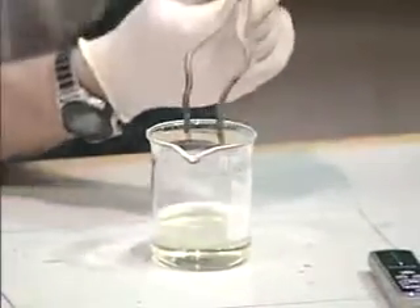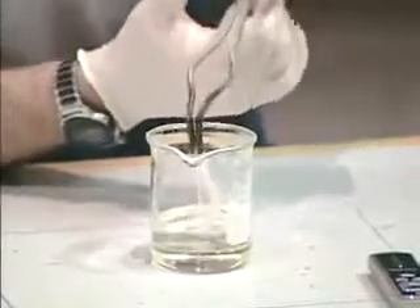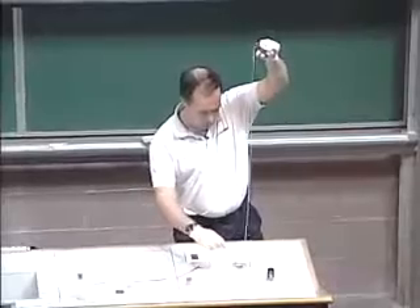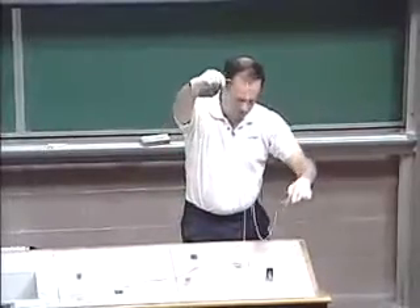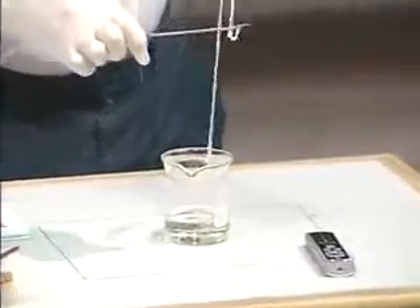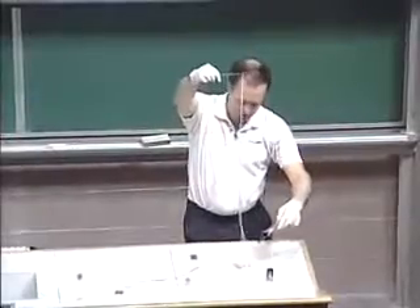So then I'm going to reach in here, and where the interface is, I'm going to pull out some nylon. Here we go — we'll see how much nylon we can pull out of this thing. There's a meter or so... two. There are records set for this, and I think it's actually in the Guinness Book of Records. I'm sure we're going to beat that record today.